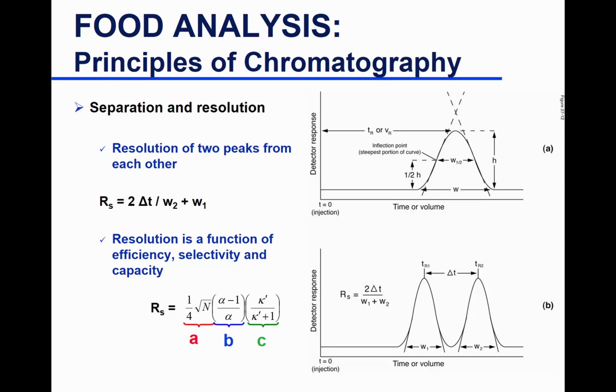Of course, there's going to be diffusion, but you do not want a lot of diffusion within the column. You want the movement to be in and out from your stationary phase to the mobile phase and get equilibrium that way, and move in a sharp, tight band. Moving in a sharp, tight band will illustrate a sharp, tight peak.